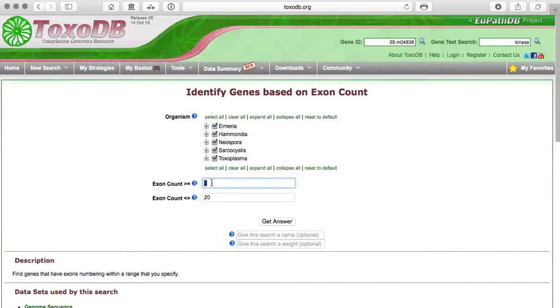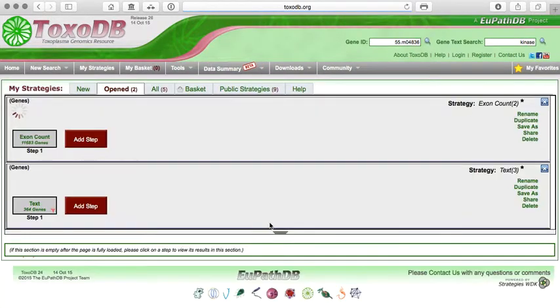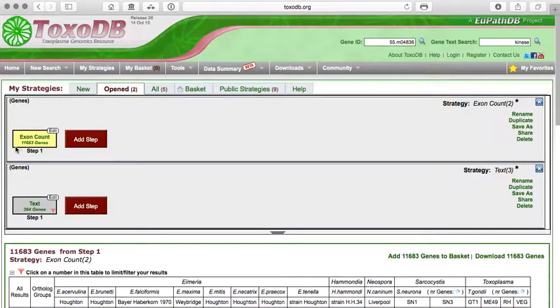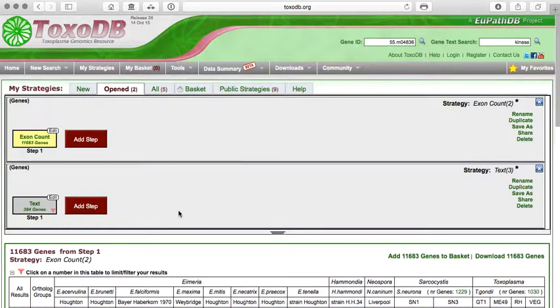And so, for example, I can change these numbers to 7 and 8. So let's say you only want genes that have at least 7 exons and no more than 8, and you run the search, you will get back a number of genes that meet these characteristics. And so that's information.